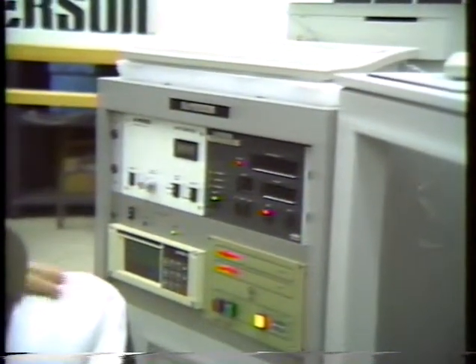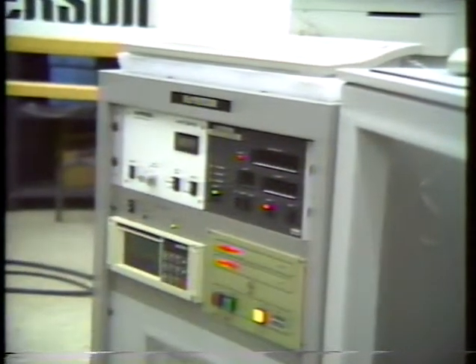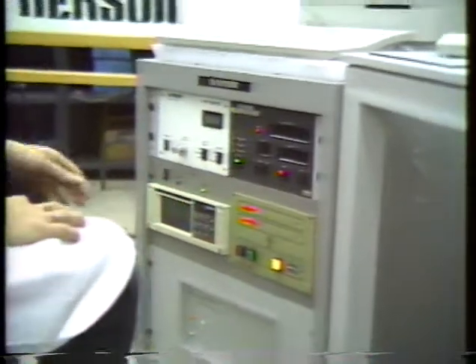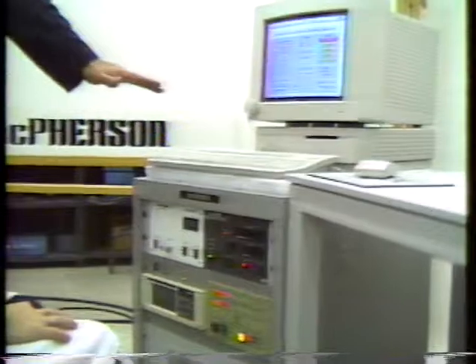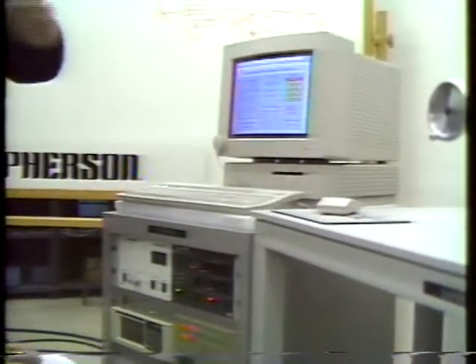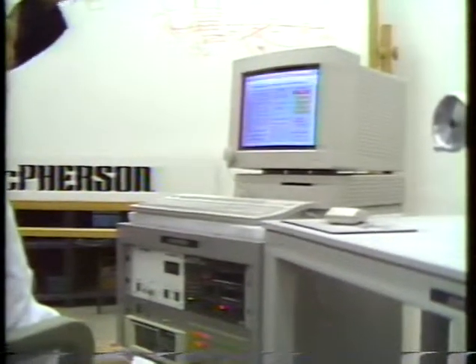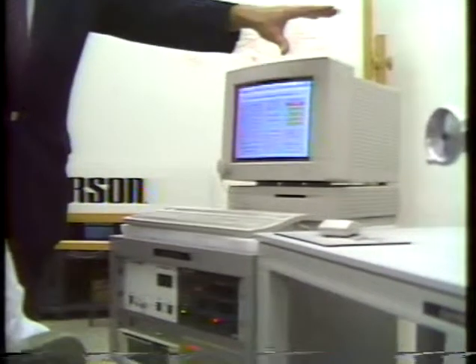Now, how many volts do we have on the photomultiplier? Can you show me this, please? Okay, you have 778 volts on the photomultiplier. Very good. Thank you. That gives us the voltage we have. And in this case we would obviously look first where we have the highest signal coming through on a scan, so we don't run off scale, right? That was the 160. The 160 was the highest one, and you choose it because this is the strongest line in this particular deuterium lamp, right?